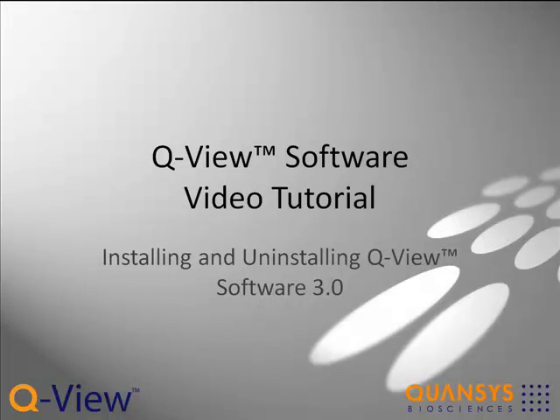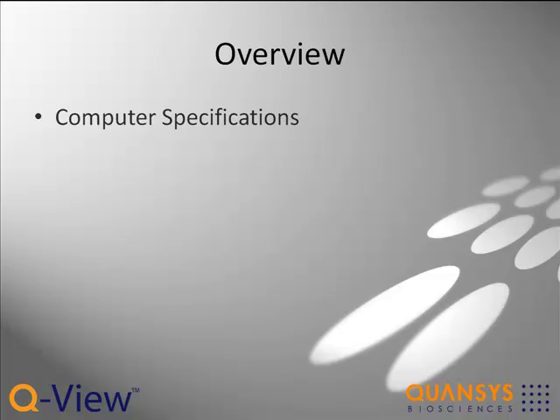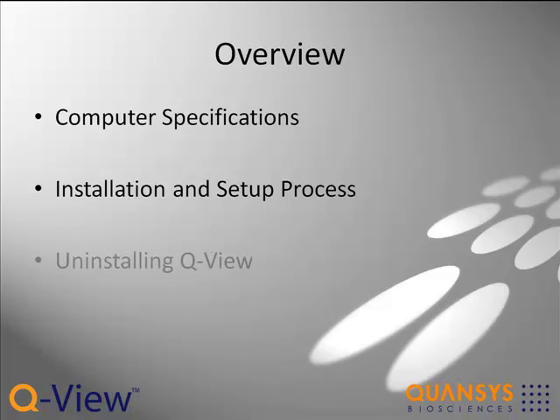Welcome to this section of the video tutorials for Q-View Software 3.0. In this video, we'll discuss the minimum computer specifications required to install Q-View, the installation and setup process, and how to uninstall the Q-View software.